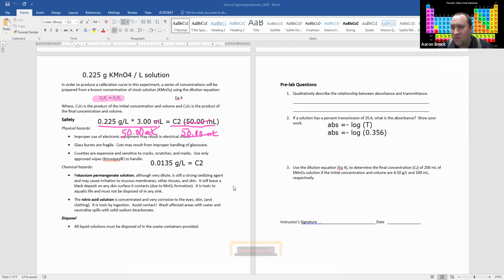So this relatively short video will fill in more of the blanks about how to use the instruments and how to make those calibration curves when you come to lab this week. But this should at least give you a good jump start on doing the pre-lab.